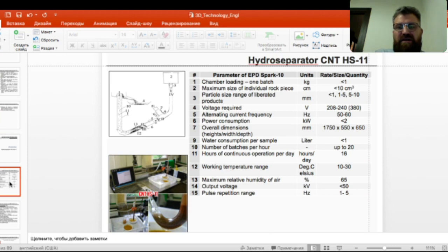The story behind it: it's 20 years now, I think, since the first hydroseparator was applied, as I said in my first stage presentation, for recovery and concentration of precious metals, very fine grade precious metals. So for now, this approach is used in many different areas of mineral research. It works best with less than 1 kilogram sample. I mean, it's the quickest way.